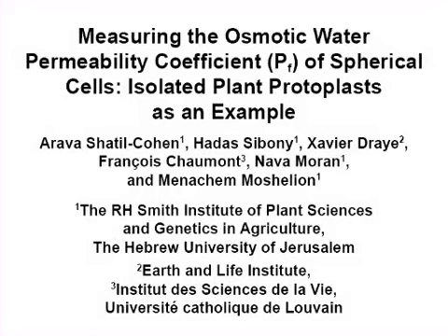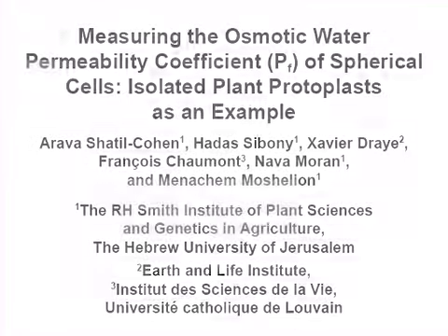The overall goal of the following experiment is to learn about the function of aquaporins by determining the osmotic water permeability coefficient, or PF, of plant protoplasts.